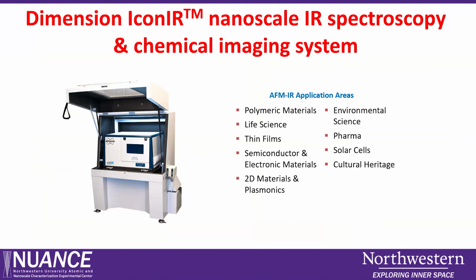I will touch base a little bit about the Dimension Icon IR spectroscopy system. This system will be here maybe in a couple of months, because we already placed the order and are trying to acquire the system. It will replace the space where the fast scan is right now.